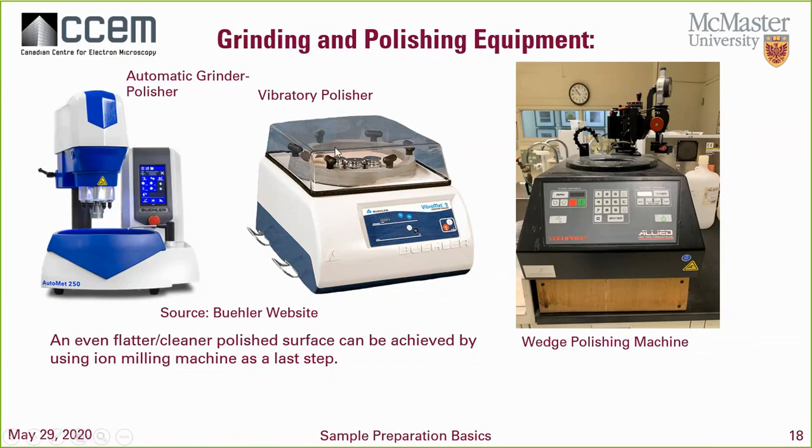So the way that this works is we add the colloidal silica or the slurry up on the top, and we set up the machine to vibrate. Usually I put it to about level 3, and because the holders have a little weight to them, it allows the sample to rotate due to the vibration, polishing at the same time. Usually I would say after about 2-3 hours, you will have a perfectly polished surface, assuming that you don't have any of the previous polishing steps in it, okay? Now, it's important as well to make sure that you clean your sample after this, just to make sure you don't over-contaminate your surface, okay?